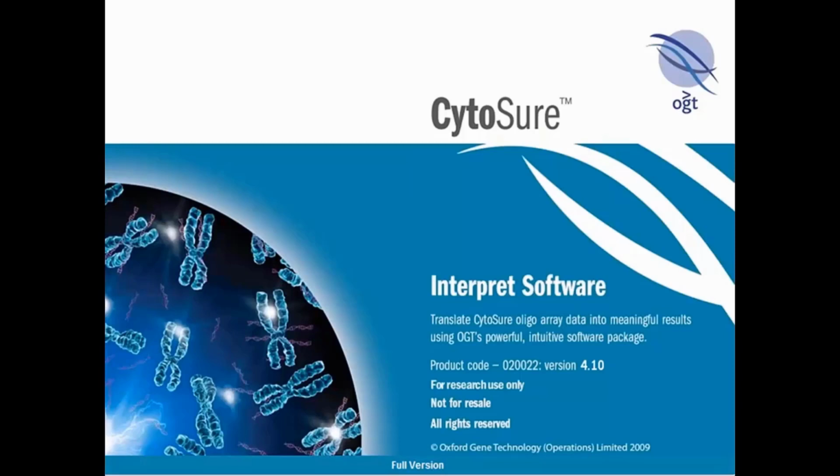Hello and welcome to the first of this two-part video tutorial introducing the CytoSure Interpret software, the powerful and easy to use software package for the analysis of array aCGH data. This video will describe how to import sample information and process the raw data to automatically detect copy number changes in your samples.